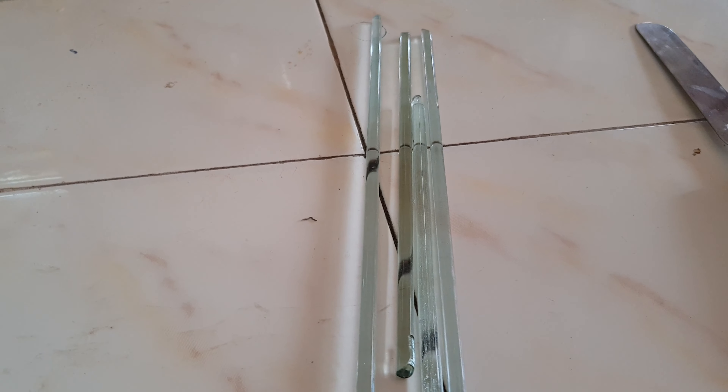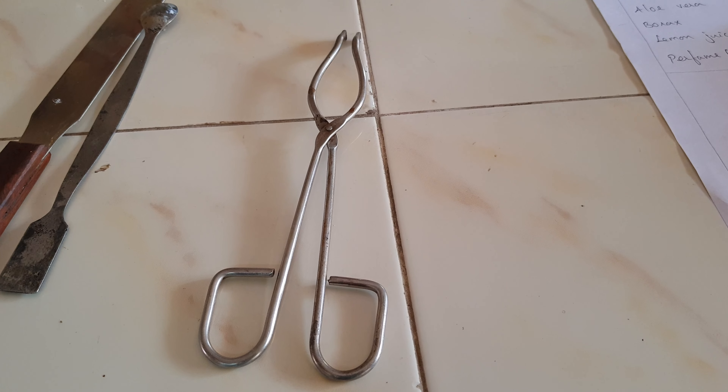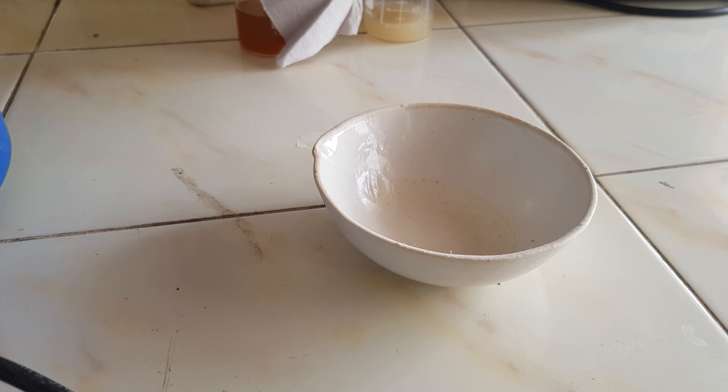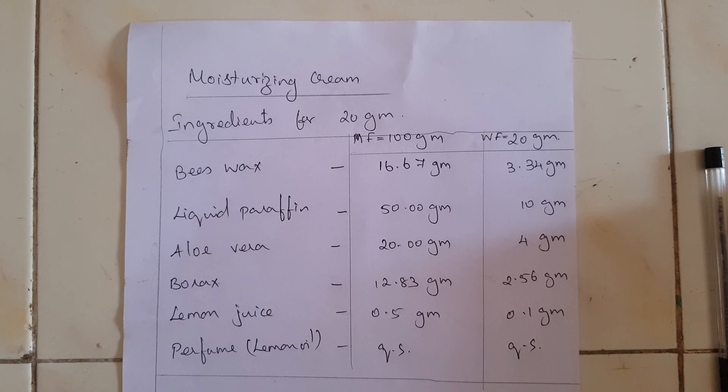Additional equipment includes glass rods, spatula, tongs, china dish, mandle, and a water bath.